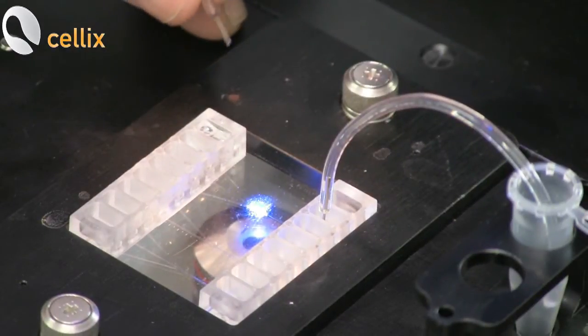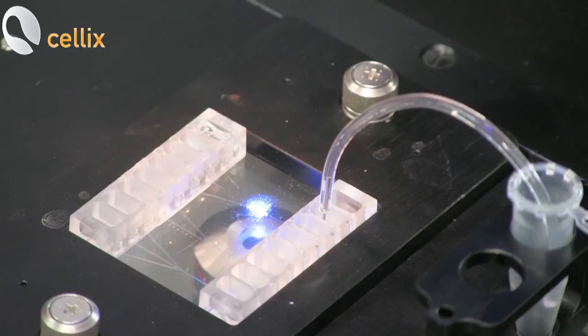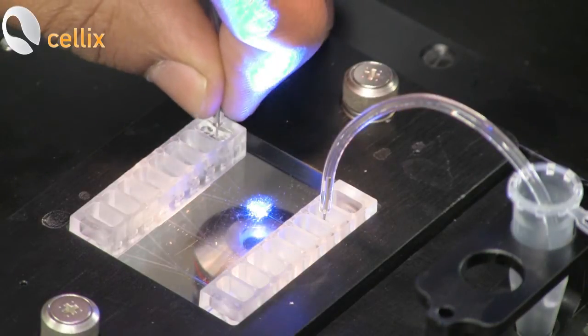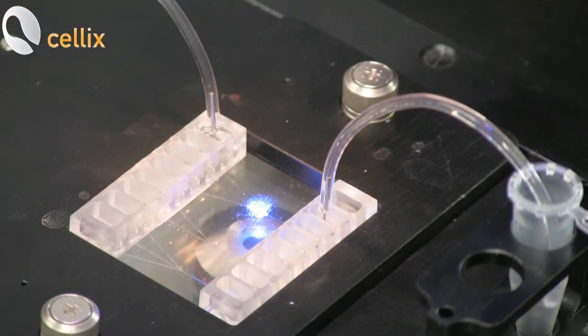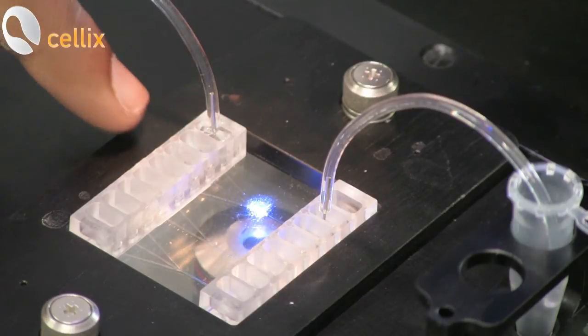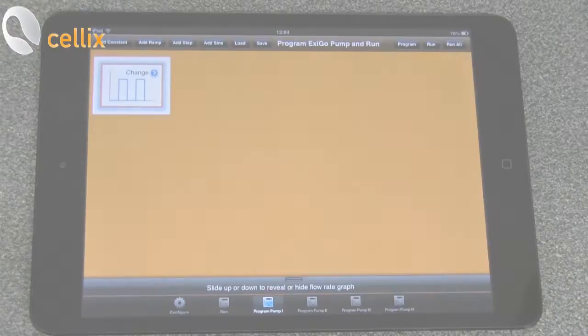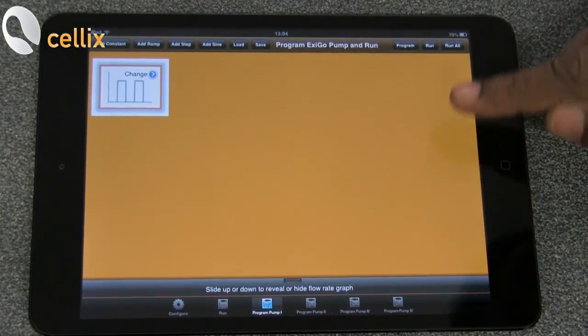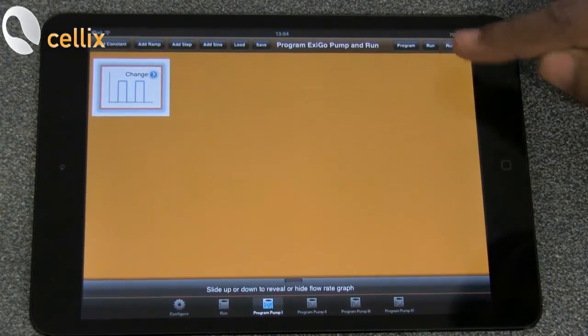Now I am going to connect into the chip. You can see the tube from the output of the sensor goes into the chip. You can do the same for the next 2 pumps. Once we program all the 3 pumps, go to the pump 1 and run all.